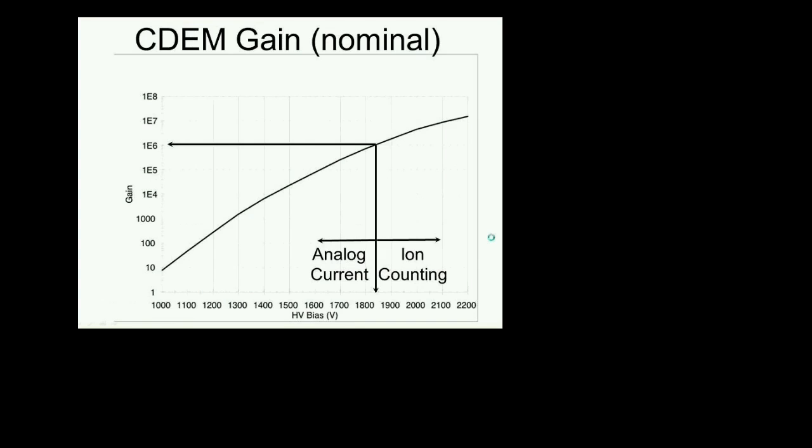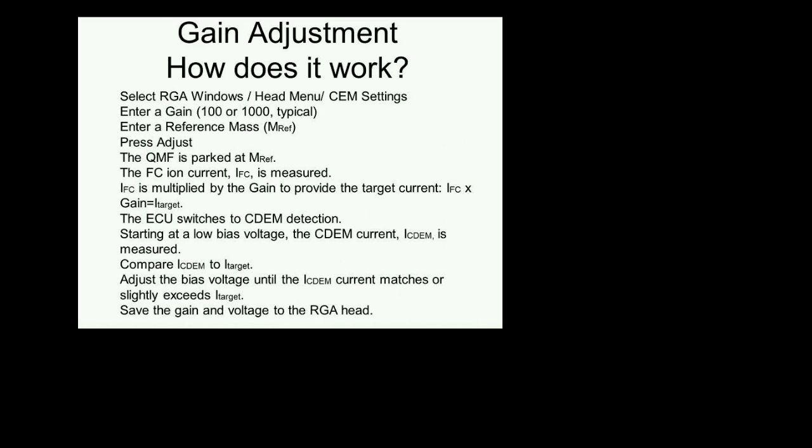Okay? So on the next slide, if you have the slide, I show you how the gain in the electromultiplier depends on the high voltage. And you can tell it's a pretty steep curve. It's kind of a log curve on this side, a linear log curve. And you can get a lot of gain out of these devices, and typically you'll go above a gain of 1 million if you're doing any sort of ion counting.